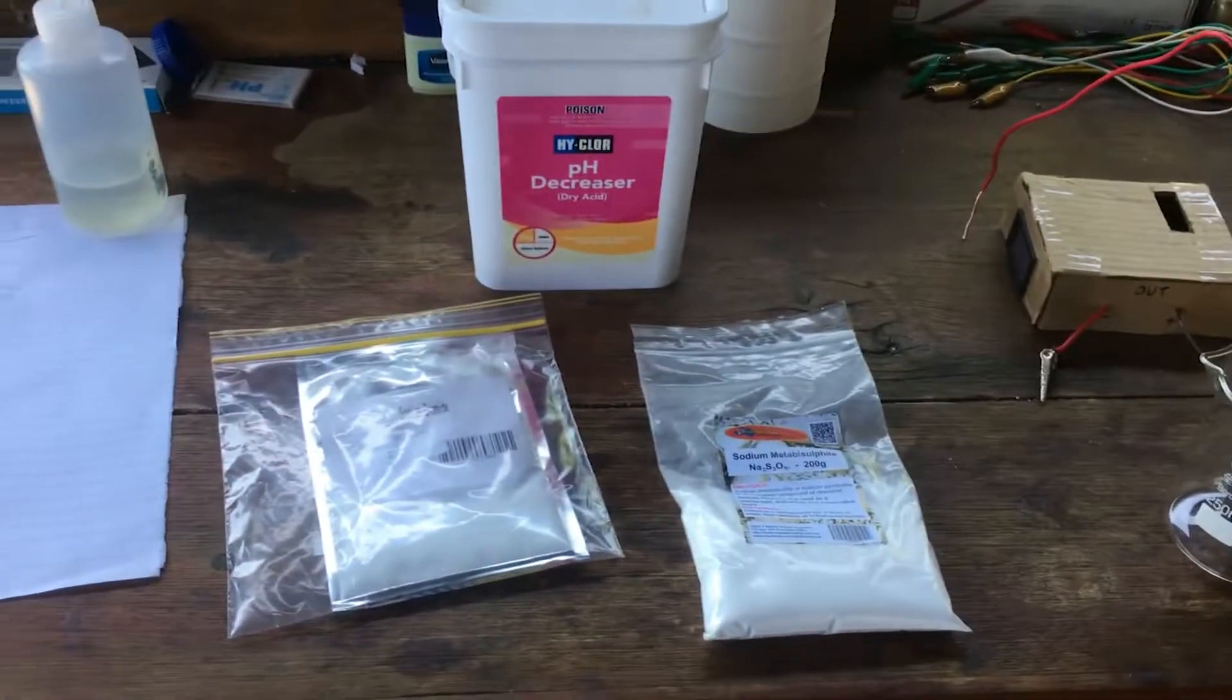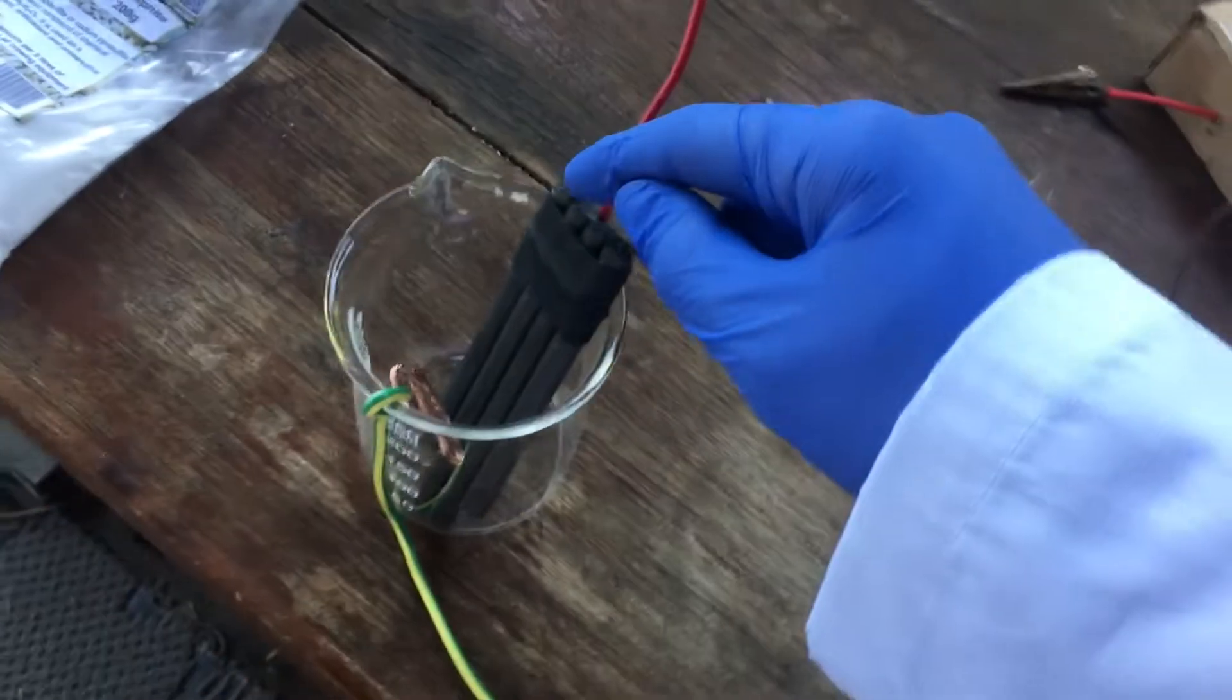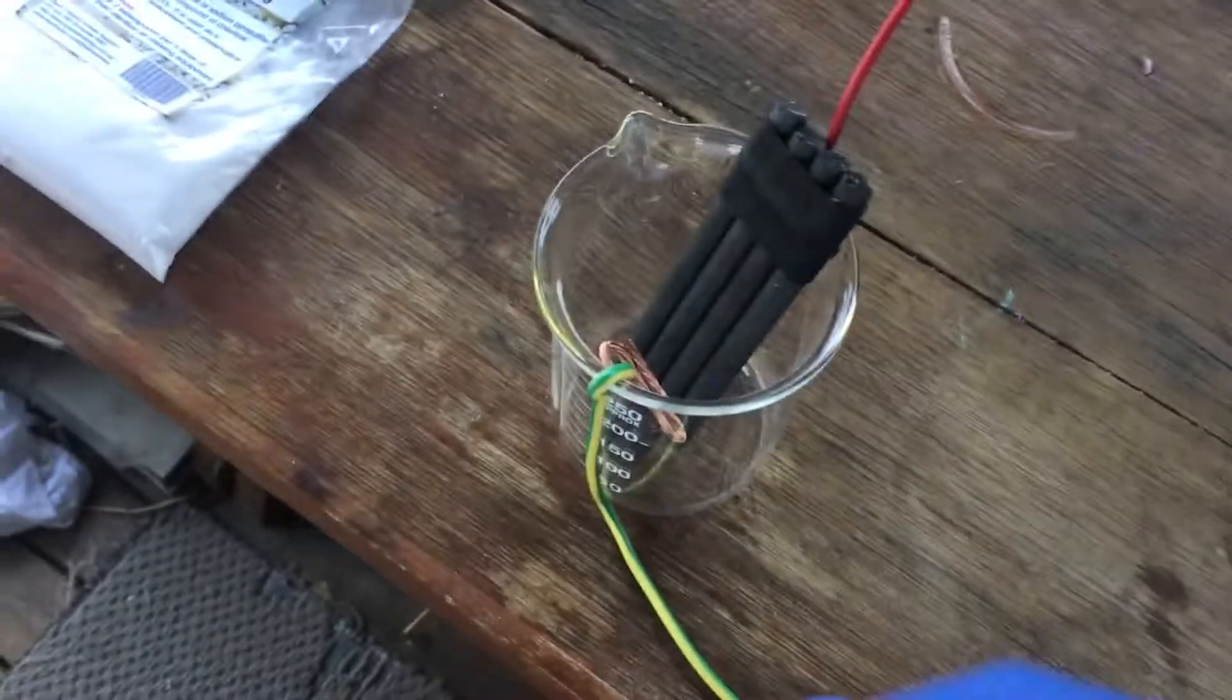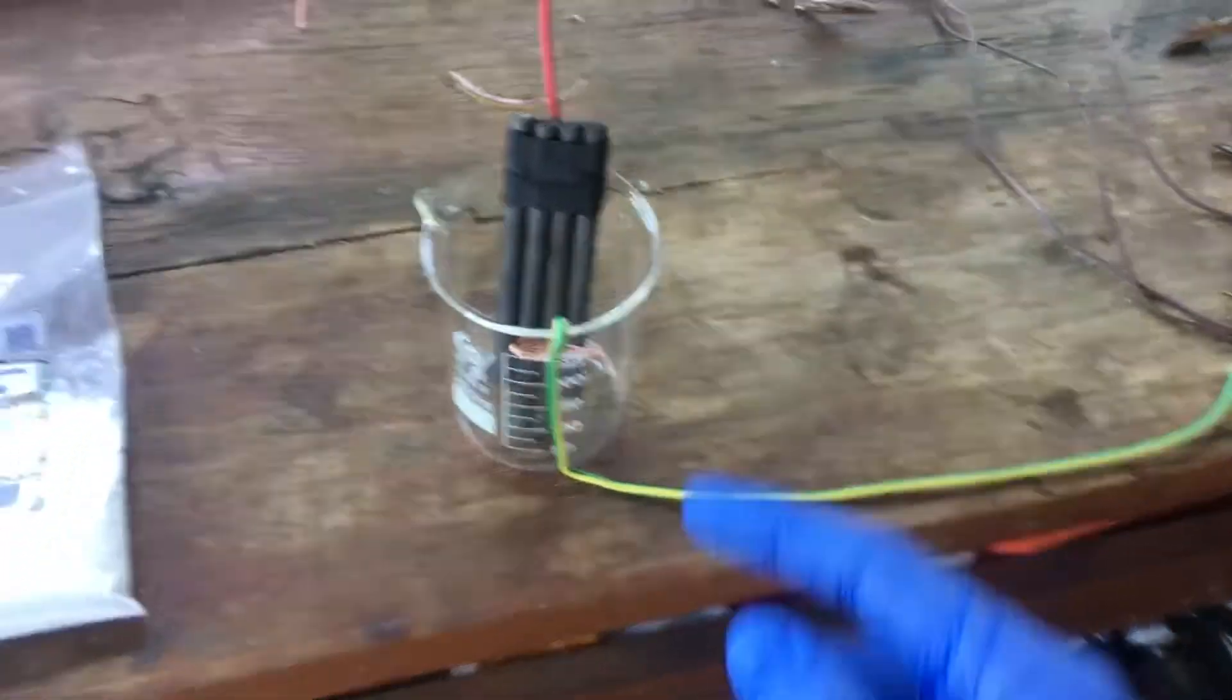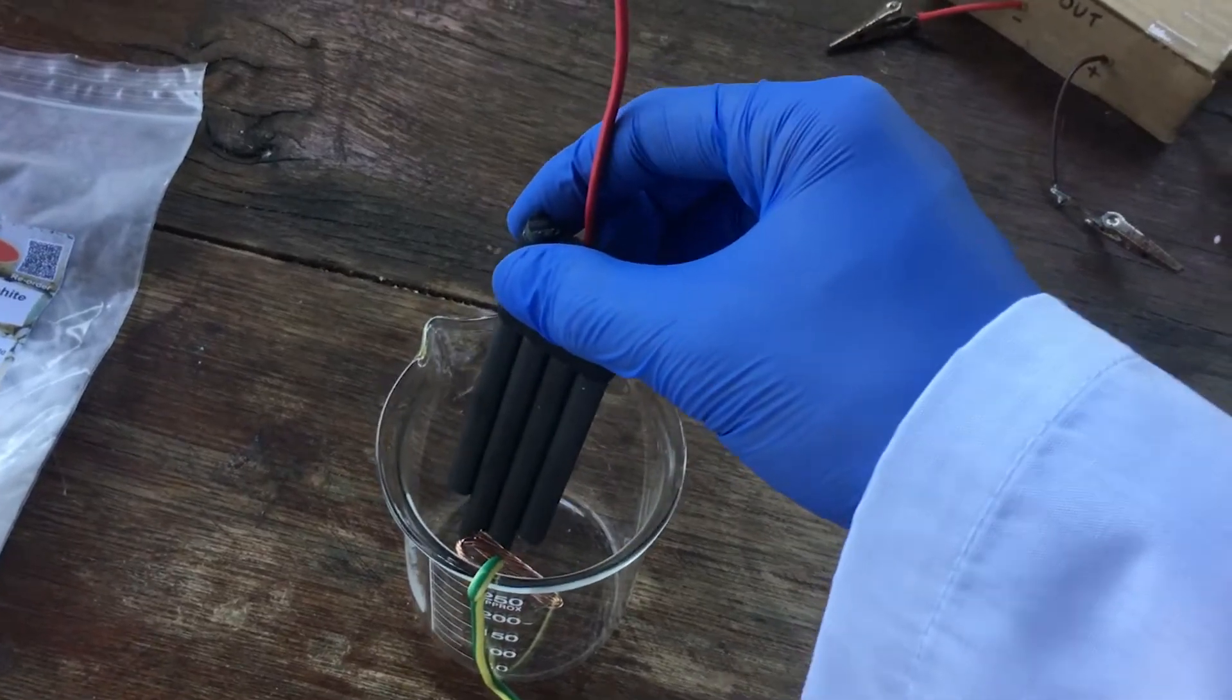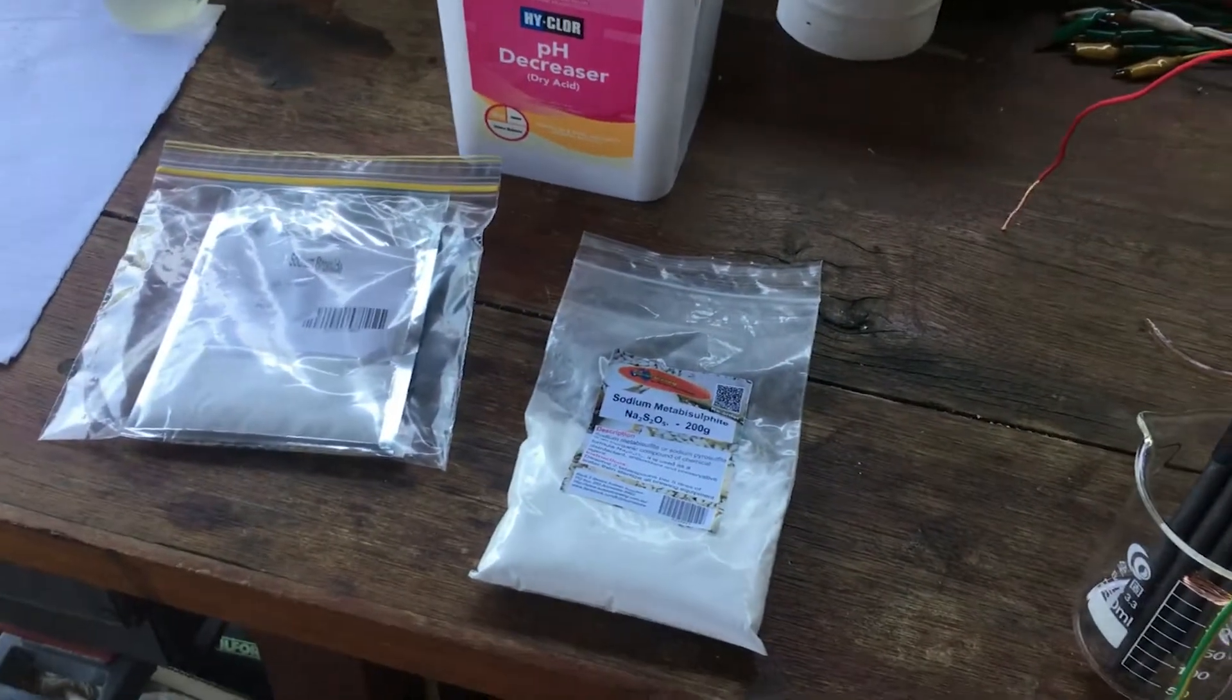The actual mechanism of the reaction is pretty simple in theory. We make up a solution of sodium bromide and then electrolyze it with a cell, a carbon anode and a copper cathode. What we should generate is elemental bromine on the anode because the bromide ions are oxidized to bromine. And then on the cathode, we'll be generating hydrogen gas from water. In practice, however, you also end up generating hydroxide ions, which go on to react with the elemental bromine formed on the anode and end up just converting that bromine into bromate or the bromate ion.